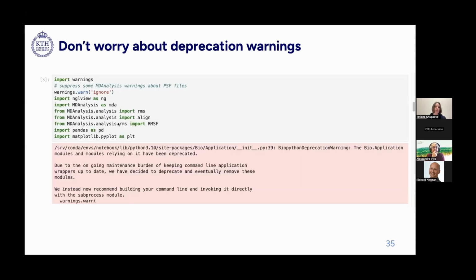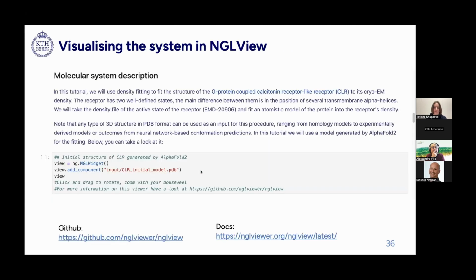Then we want to import the Python packages that we're going to use in the tutorial: NGLView to visualize molecules, MDAnalysis for analysis, and pandas and matplotlib for data visualization. In some of the cells, you can get warnings. Read the warnings and be careful with them, but this particular one is not important.